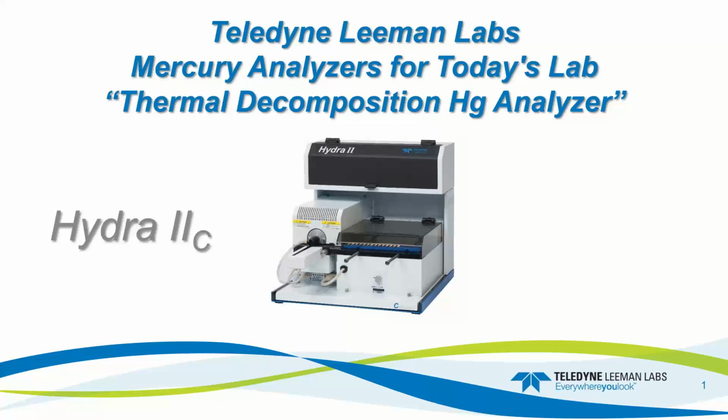Today's webinar topic is Operational Theory and Software Basics for Teledyne Leeman Labs Hydra IIC CVA Mercury Analyzers. Our presenter is Sarah Kennedy, Applications Chemist for Teledyne Leeman Labs.